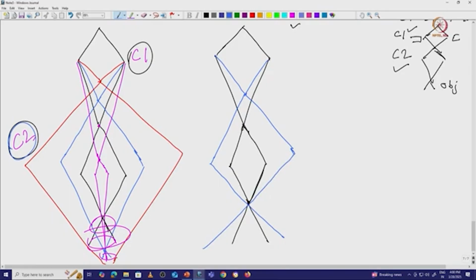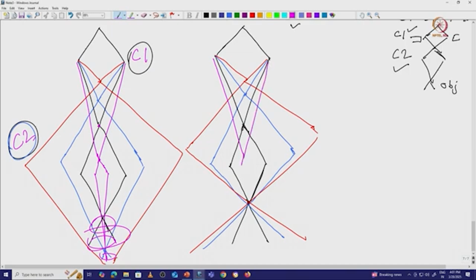Okay. Now I am using another, third ray. They converge here, and then it will go through this one. Now we have the other possibility, that one ray comes something like that, goes through this particular point and gives us an image.